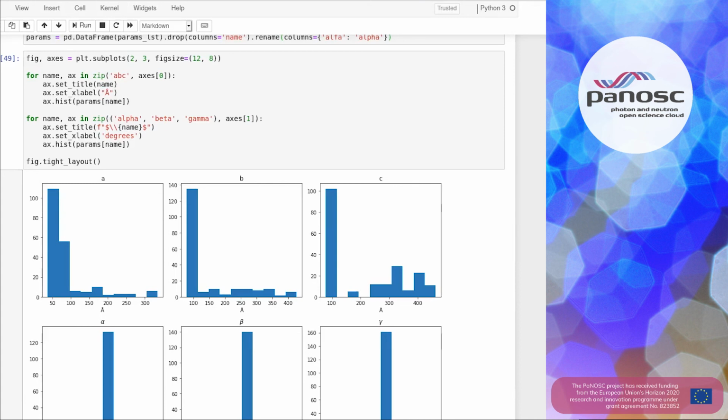We've shown here 3 rounds of simulation and analysis. You could easily go back and forth many more times, introducing different complications in the simulation and finding out how to adjust the analysis to cope with them. This flexibility is the real power of notebooks, along with remote access to a powerful computer to run the simulation and analysis quickly.